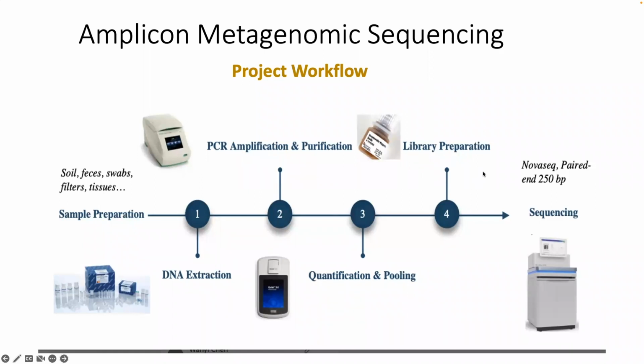One thing I do want to mention is third-generation sequencing here. So this is an option for the same reasons that Kyle brought up earlier. Using a combination of Illumina and PacBio can help you better understand your organism. Caveats would be cost, redundancy, size of data needed, but it is something that is offered and it is something that is doable.